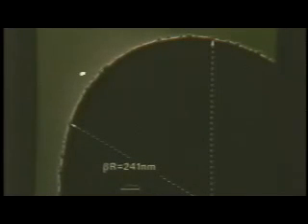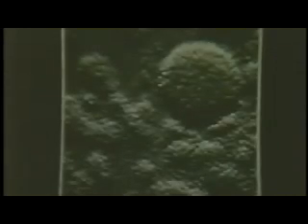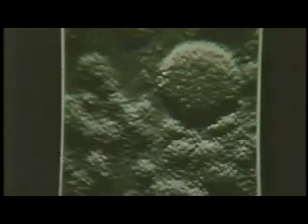Can I have the next one? Here's a picture of some molecules called ferritin in the transmission electron microscope. Their iron-rich core is all you can see. You can't see their protein shell because it's not stained. On a field emitter tip, we're going to image over this area. And what you see is an image like this. This is a three-dimensional reconstruction, very simple, of ferritin clusters.